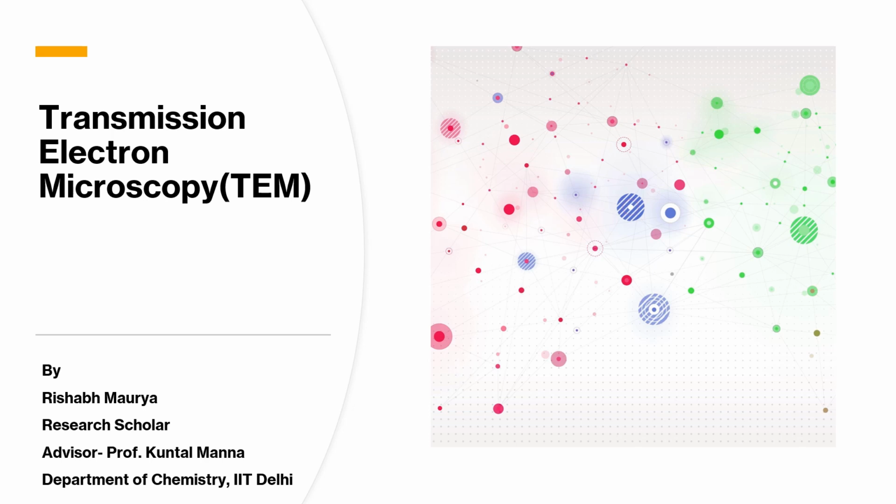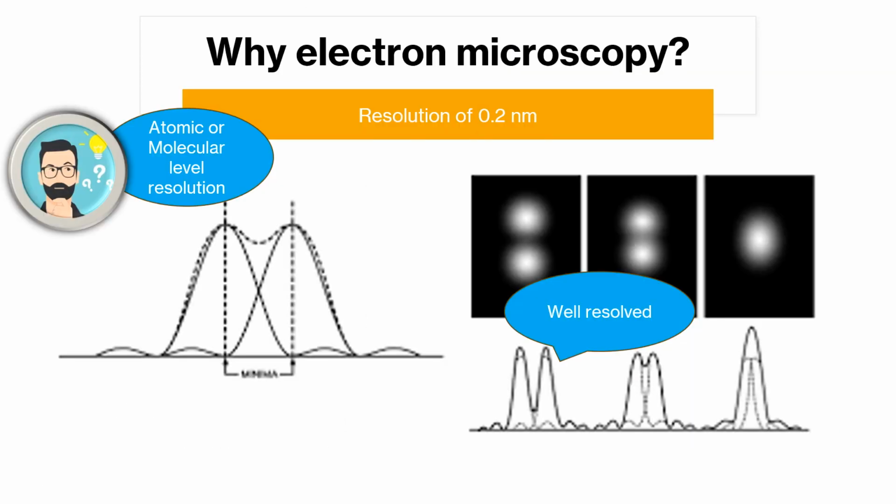Hello all. Today we are going to discuss the topic transmission electron microscopy and its application in metal organic frameworks. How we can use it for metal organic frameworks imaging. So starting with this, why do we need electron microscopy?